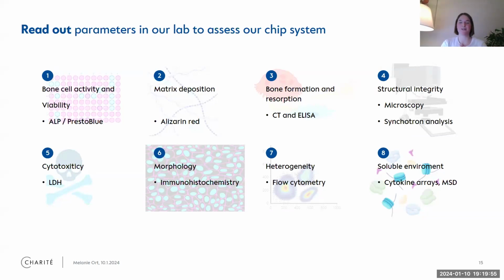We monitor cytotoxicity with LDH release. It's an enzyme. I show that later as well. Morphology, immunohistochemistry. We look at the heterogeneity of the immune cells especially, and then again the soluble environment like cytokine arrays and MSD, if you know this platform.